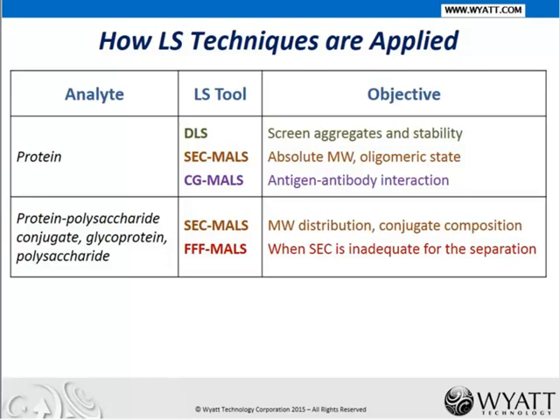When SEC separation is not adequate, either due to column interaction or the polymers being too large for the SEC separation, then FFF can be used as an alternative or sometimes even as a replacement to SEC.